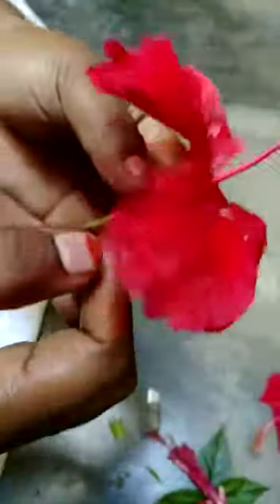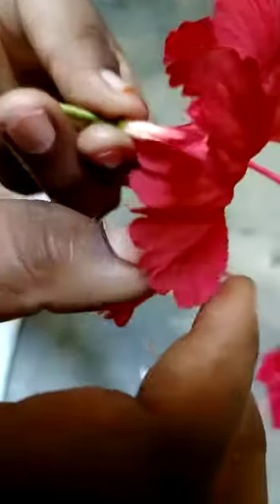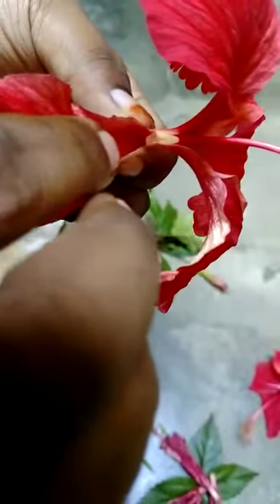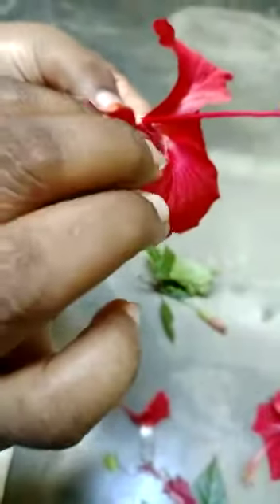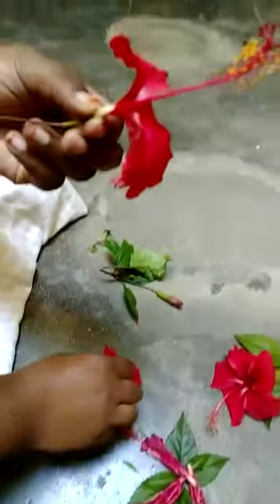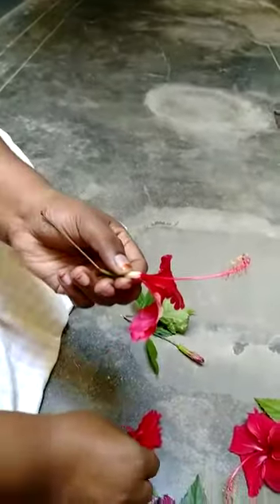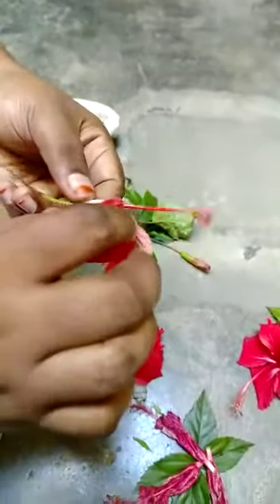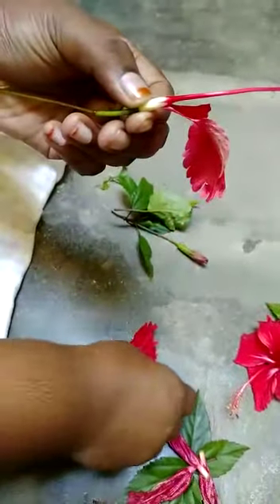Next, you have to hold this tightly from the bottom and remove each and every petal slowly. Slowly you have to remove the petals. See, these are the petals. Remove the petals gradually.